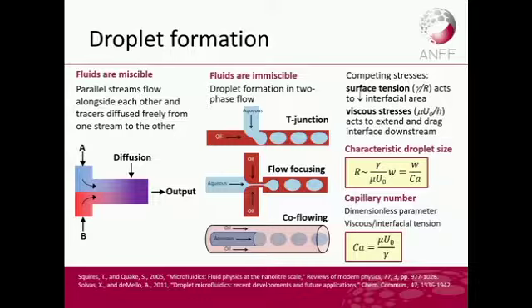So in these systems here, there are competing stresses. Basically, there's competition between the surface tension and the viscous stress. And that can correlate down into an equation like this, and you can actually get a characteristic drop size. And I just want to emphasize that this is actually an estimate. Everything comes down to when you fabricate and run the experiments that you can then get the actual dimension of the droplets.